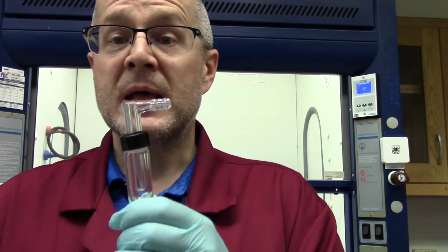How does the finger get cold, you might ask? I'm going to add cold water into this little hole right here on the top. See the little hole? I'm going to put ice cold water right in there, and that's going to make the finger very cold, so that the energy the camphor molecules get from the heat and the low vacuum, I'm going to take away from them by putting them on a cold finger. And that's how this works.